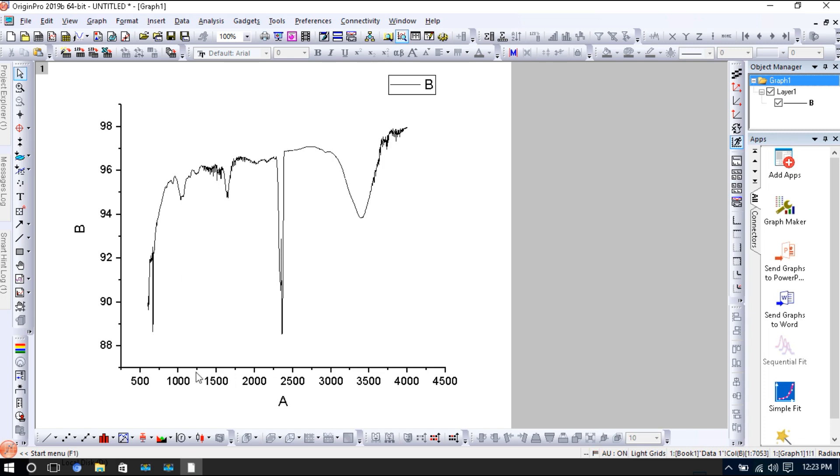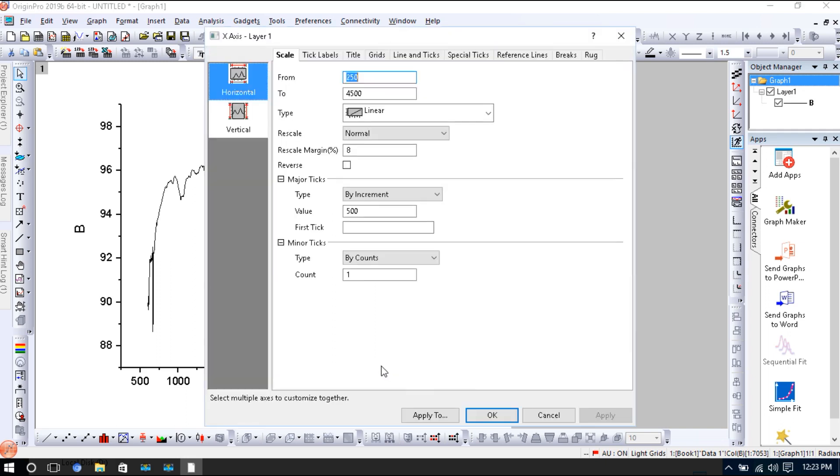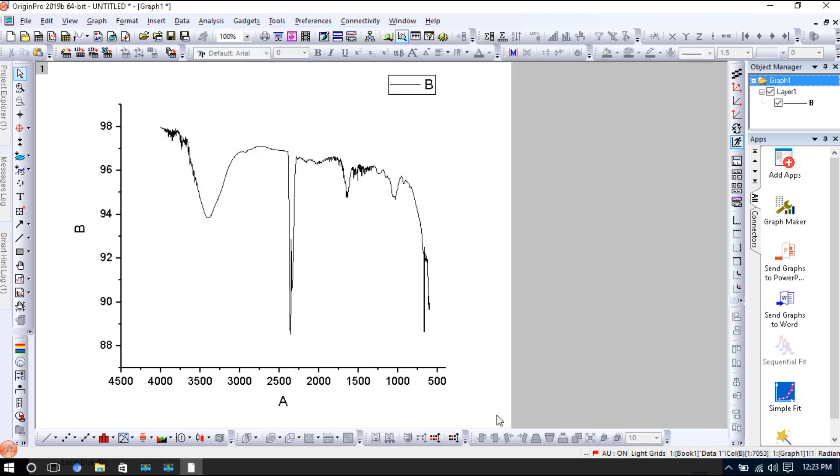But if we look at the baseline, it starts from 500 to 4,500, but we want it in a reverse form. This 4,500 should be here and this 500 should be here. We will adjust it. Only double-click this scale, right here 4,500 and here 400, then OK. Look at this, it is reversed.